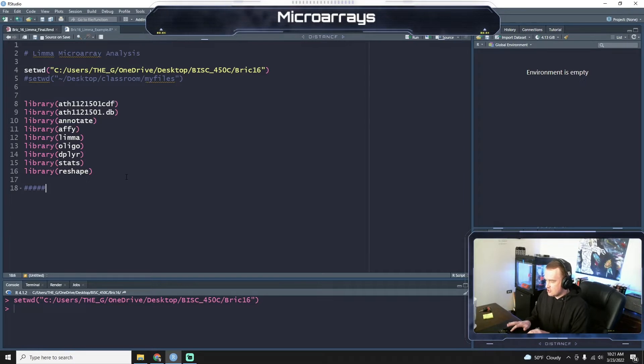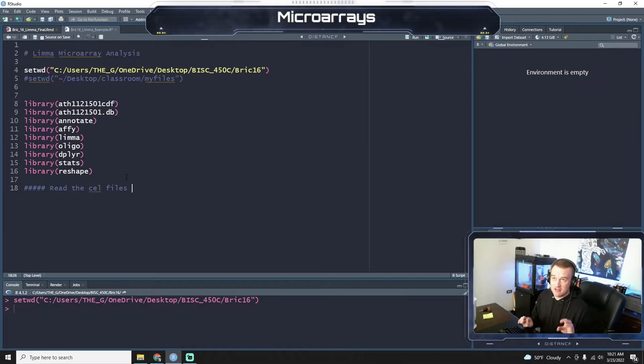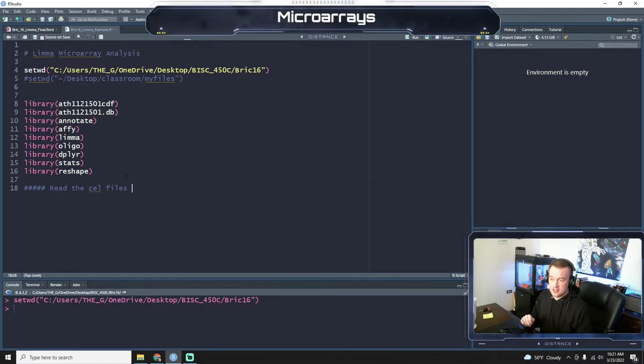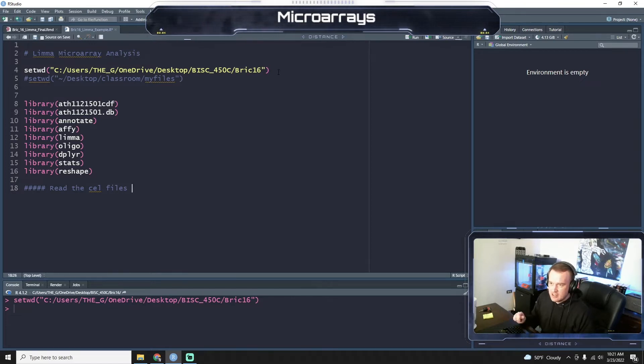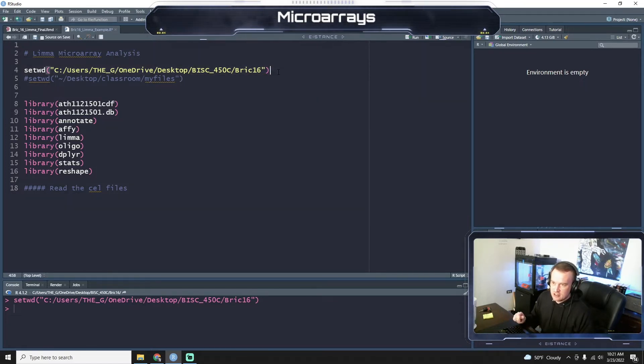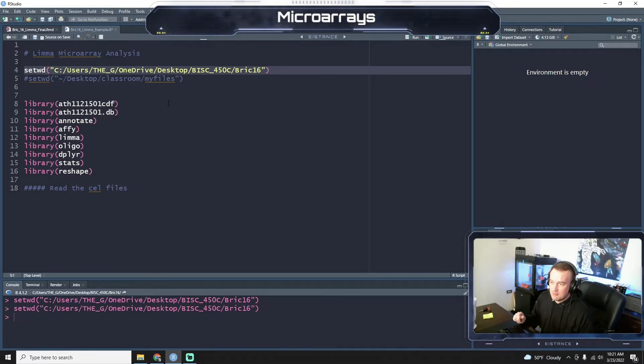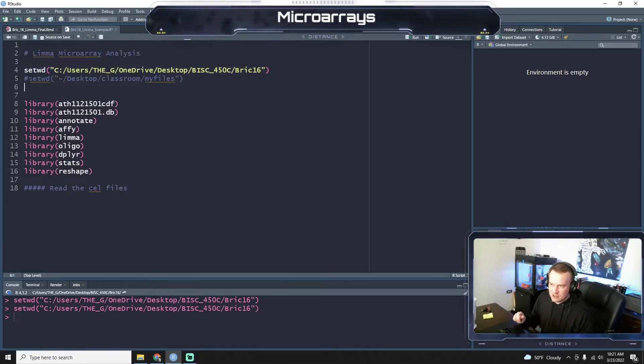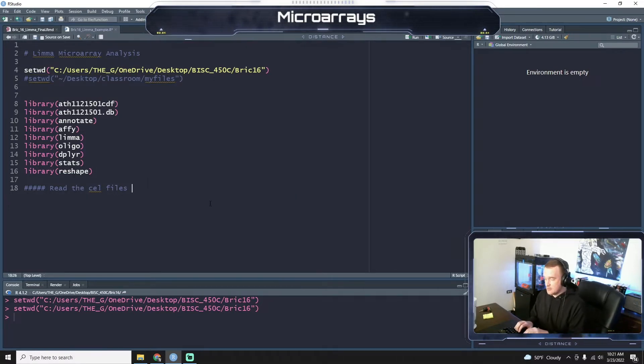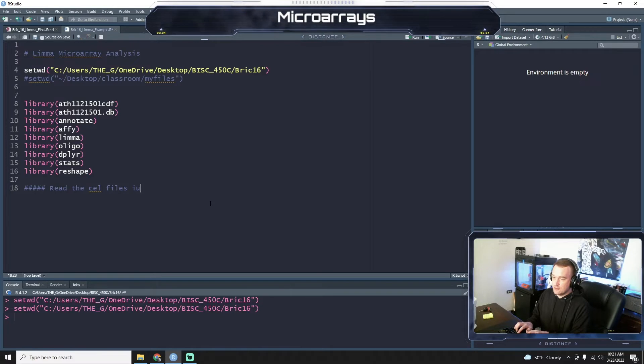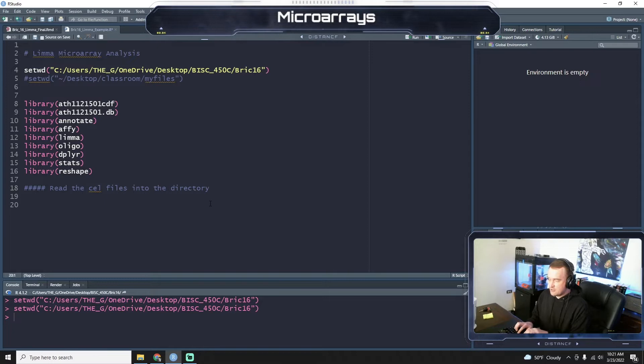So the first thing we're going to do is we're going to read the cell files. So you should have the cell files in your my files or your working directory, the same directory that you save this. Let me go back real quick. So I'm setting my working directory here to where my R script and my cell files are. For you, if you're doing this on Praxis, I have the code here, set working directory, desktop classroom, my files. And that should be where your cell files are located as well. So we're going to read cell files into the directory.